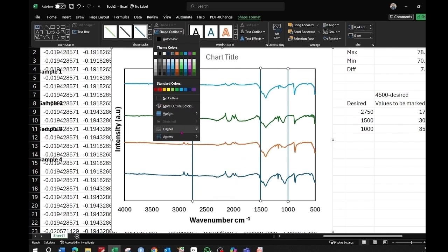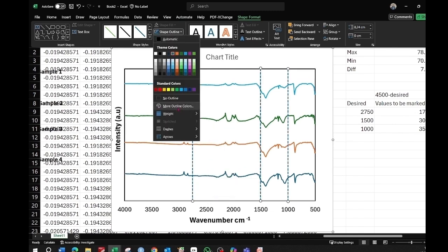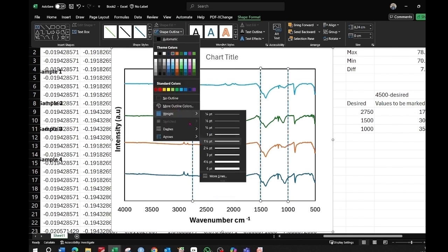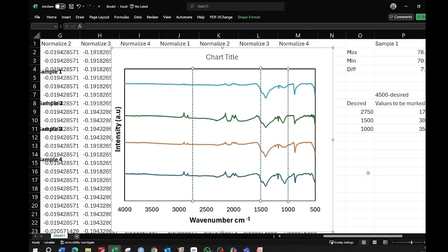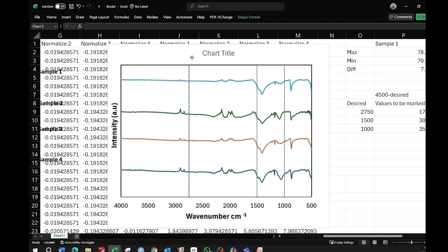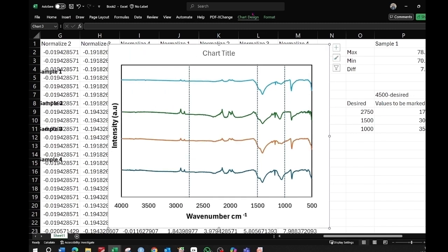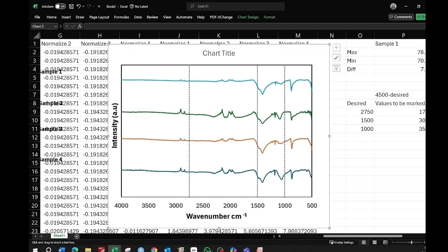Select these lines, go to Shape Format, then the Dashes option, and choose the dotted line style for a more professional look. Go to Format again and choose the Weight option, setting the width to 1 point.